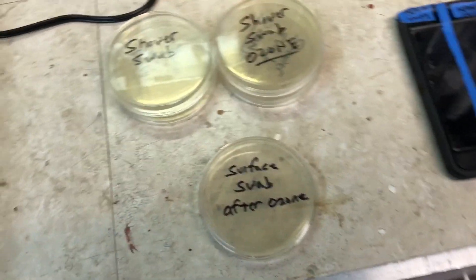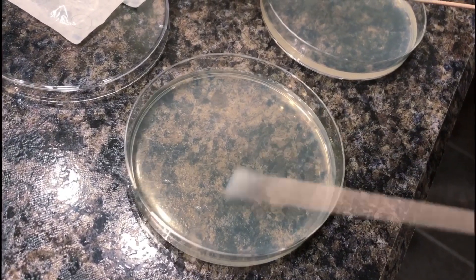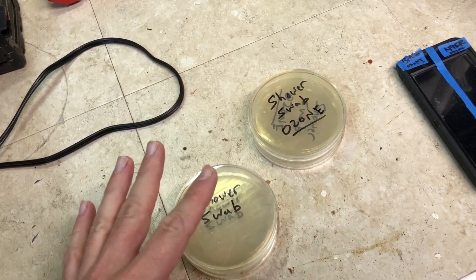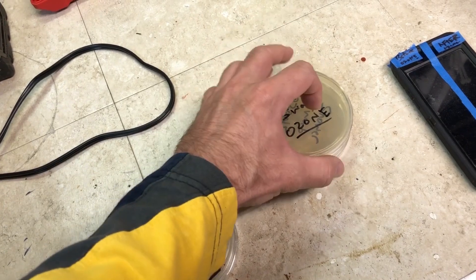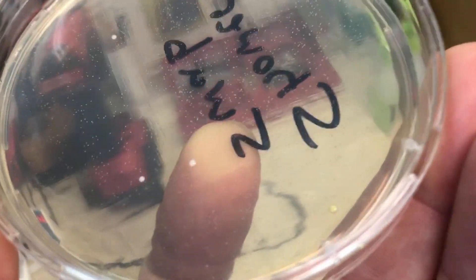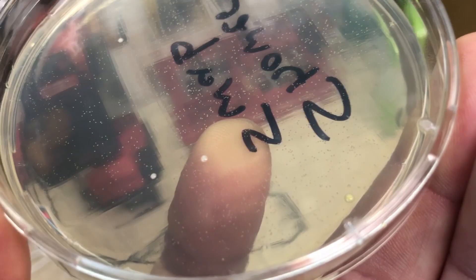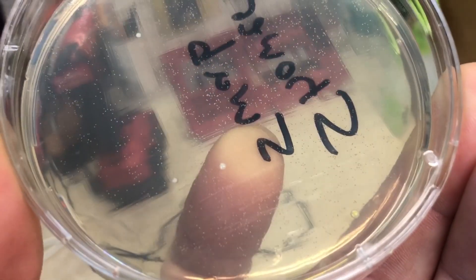Going over to here, what I did is actually took the cotton swabs and I swabbed my shower — the shower wall, the tile — to see what would happen. I did this basically the same way I did the bread experiment. I swabbed this, put these in the incubation chamber, and then I swabbed these and put these in the sterilization chamber with the ozone generator. Here's a shower swab — you can see we got some bacterial colonies growing besides the little tiny specks. Not a lot, pretty surprising considering this is a shower wall. I figured this would be a lot worse.